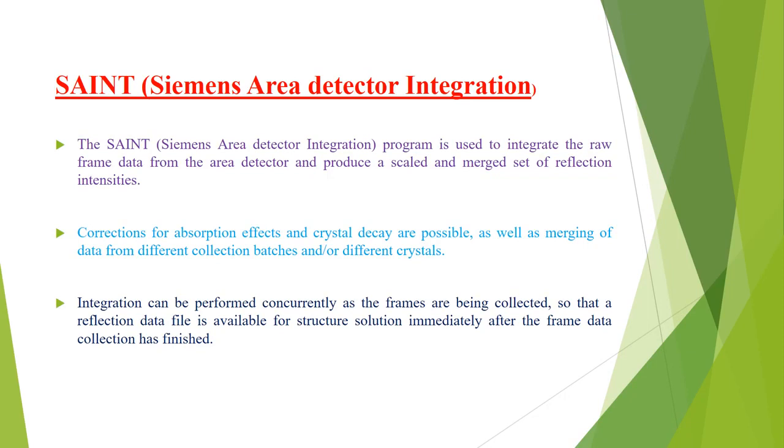SAINT, Siemens Area Detector Integration. This is another software tool that is used in the single crystal X-ray diffraction technique. The SAINT, that is Siemens Area Detector Integration program, is used to integrate the raw frame data from the area detector and produce a scaled and merged set of reflection intensities. The corrections for absorption effects and crystal decay are possible, as well as the merging of data from different collection batches or different crystals, using this software.